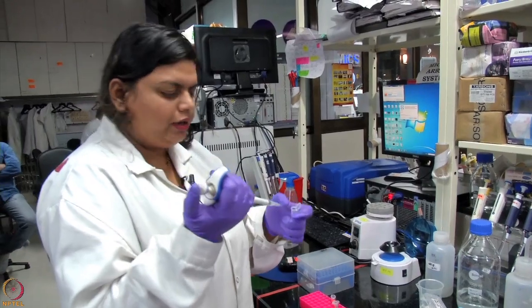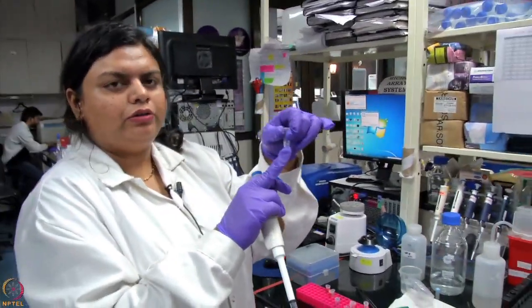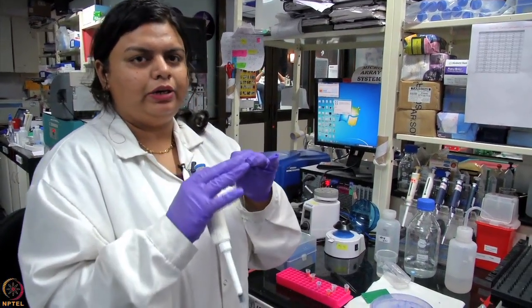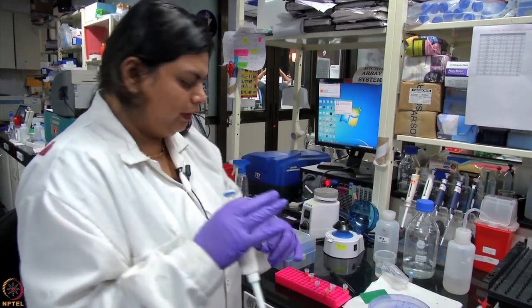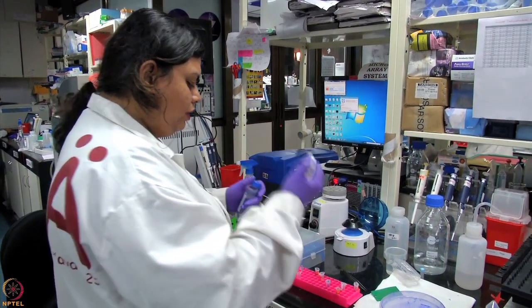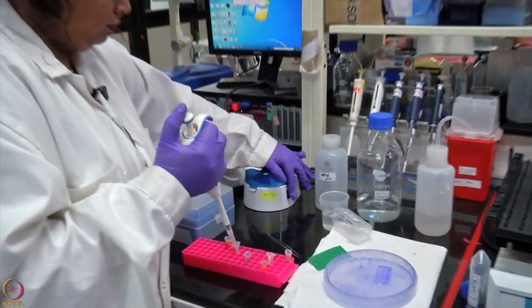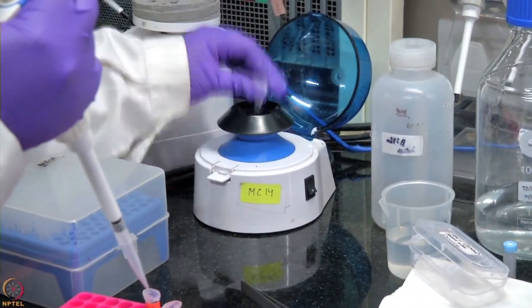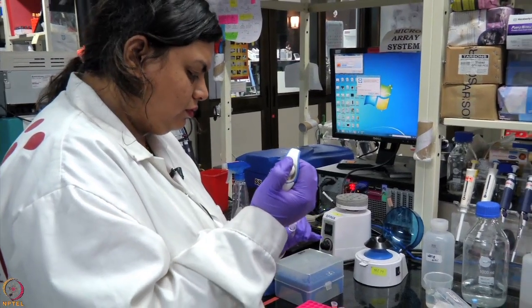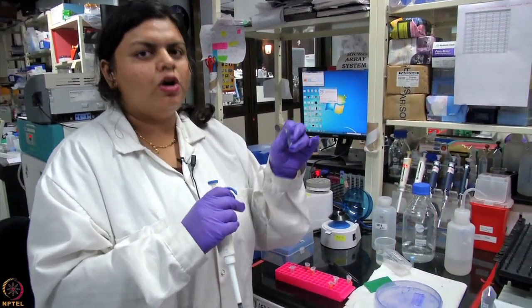So with this, now we are sure that we have got rid of all the background that might interfere with our study, and now we have only the antibody bound to the protein of interest and the interacting partners. After the elution step, even the bond between the antibody and the proteins of interest starts getting disrupted. So we will again use a little bit of IP buffer and perform a spin. Once this is done, you have to take the supernatant and put it in a fresh vial. This supernatant now contains your protein of interest as well as all its interacting partners.